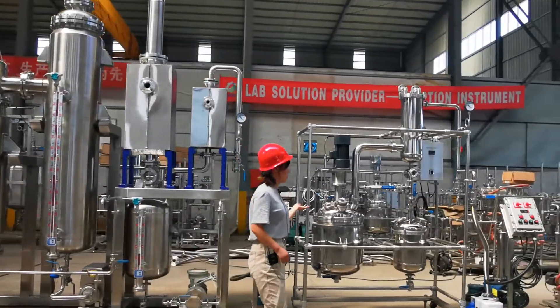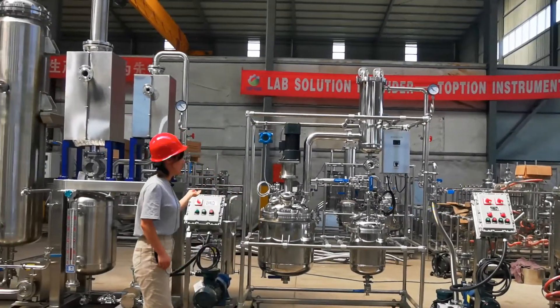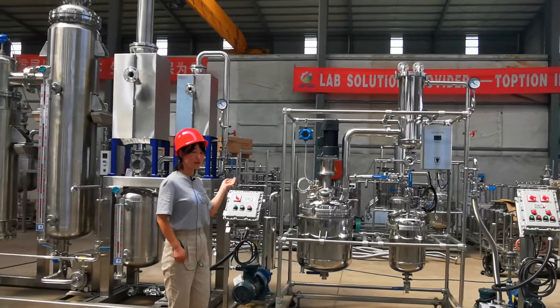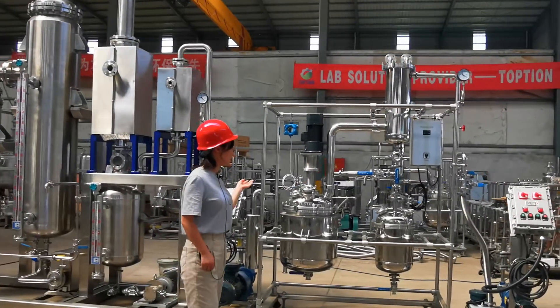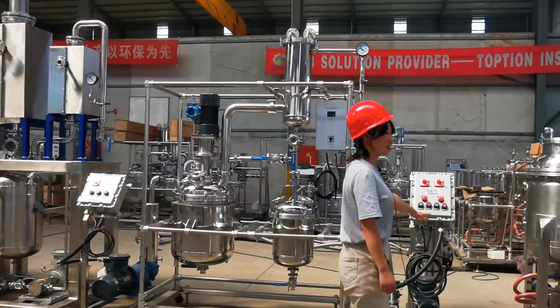And for this equipment, it's our decarboxylation reactor. For this part, in this step, we will convert CBDA to CBD.